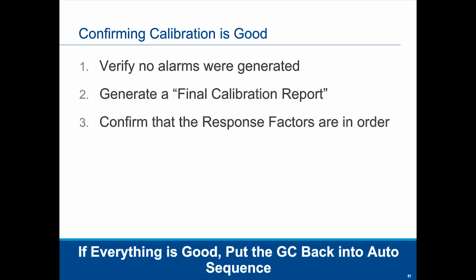And I just want to remind you again, back when we set up the streams, that calibration stream, when this runs the calibration on the liquid, whatever you set up as the number of streams to run, say in our example was 3 and 2, it will do that when it does the calibration. So you'll have your previous runs when you're running it as a stream for stability, and then when you go to calibration, it will do whatever you select as the number of runs, and then the average runs. It will do that as well. So just keep that in mind.